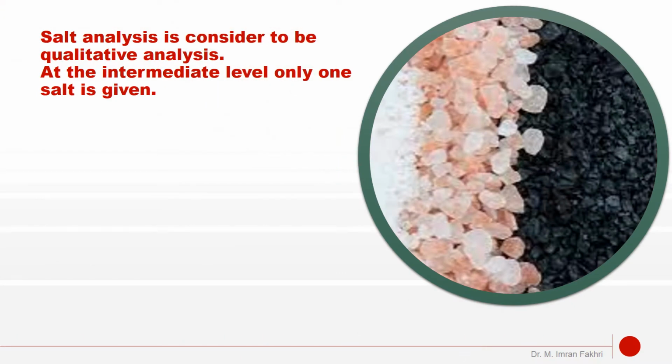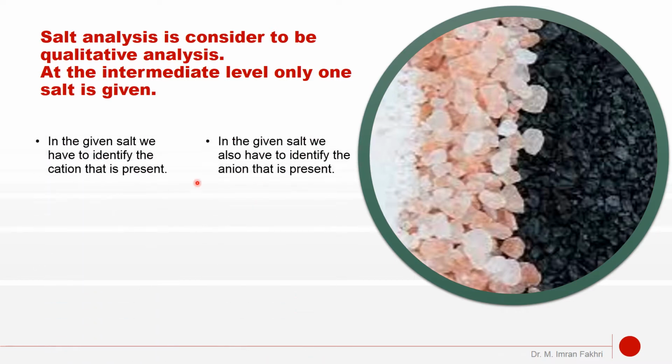Salt analysis is considered to be a qualitative analysis. In intermediate level, we are given only one salt, in which we have to identify the cation that is present, and we also have to identify the anion that is present.